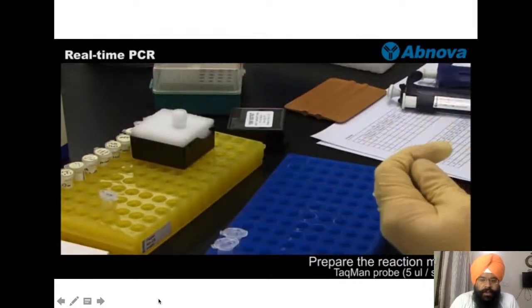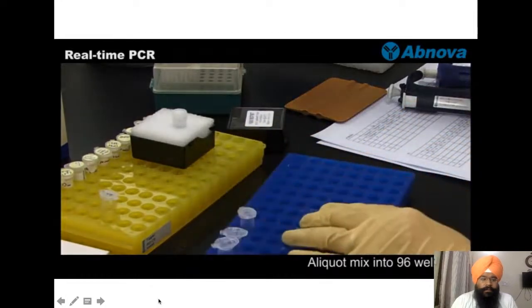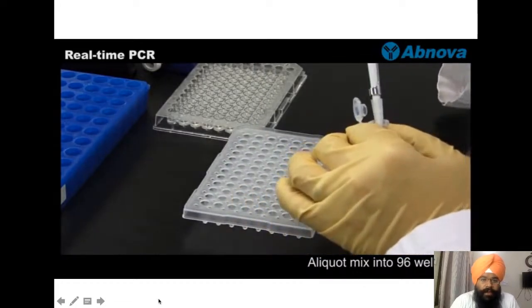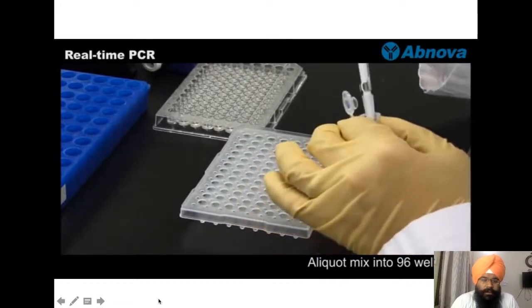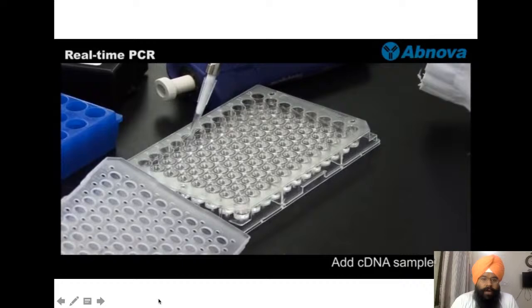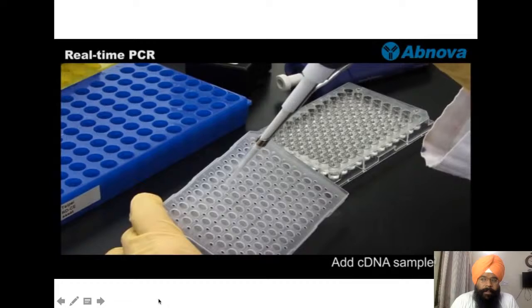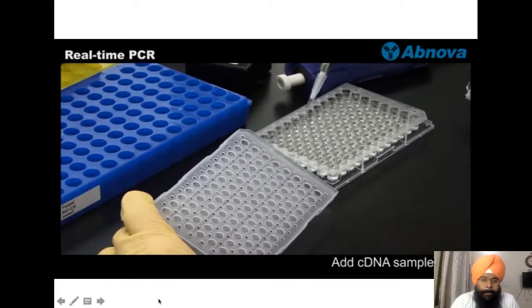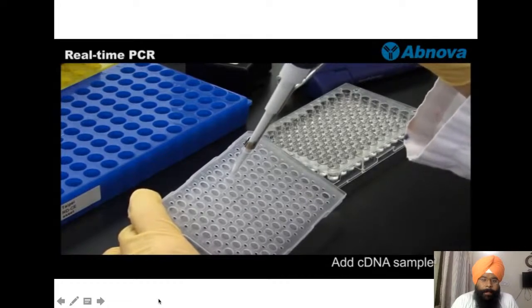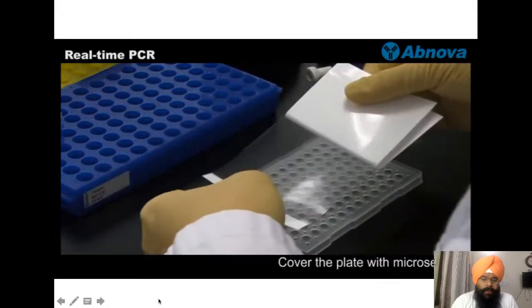Then prepare the reaction mixture with the TaqMan probe. Then allocate them into the 96 well plate. And add complementary DNA molecules, cDNA. And then cover the plate with micro seal films.